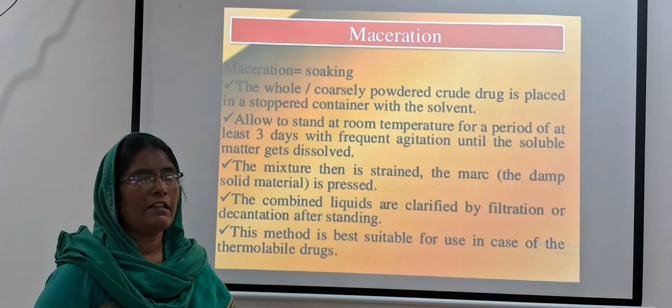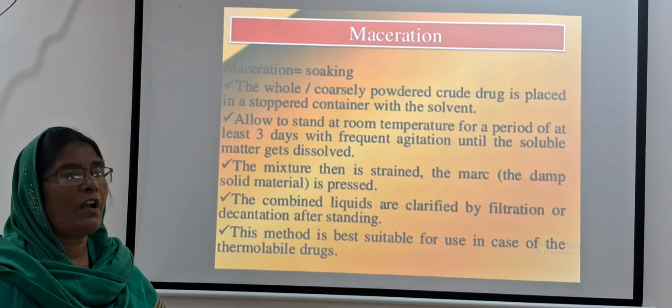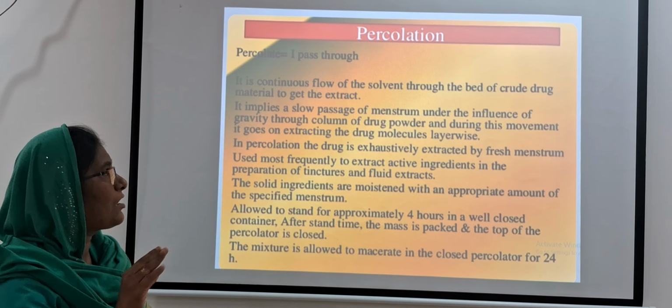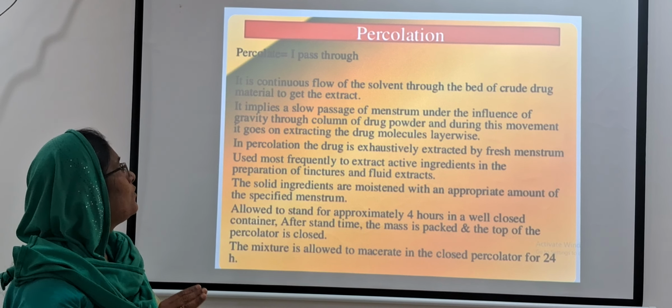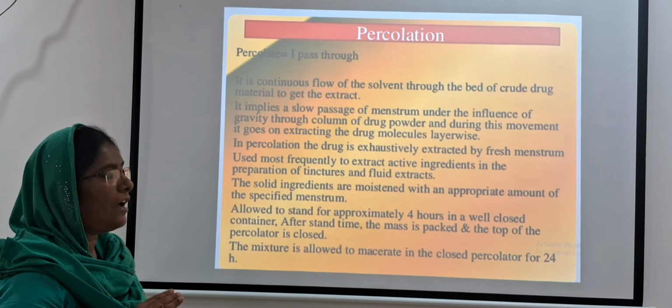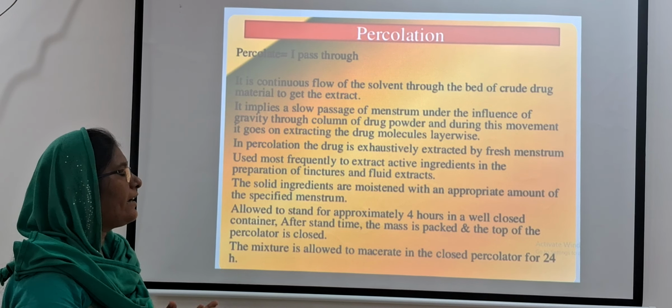Next one is percolation. Percolation means to pass through. It is a continuous flow of solvent through the bed of crude drug material to be extracted.